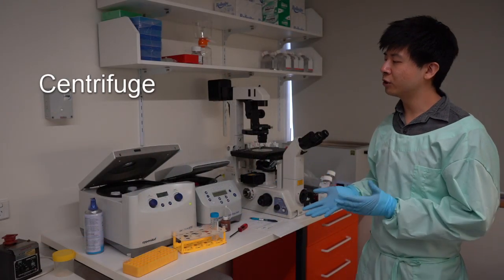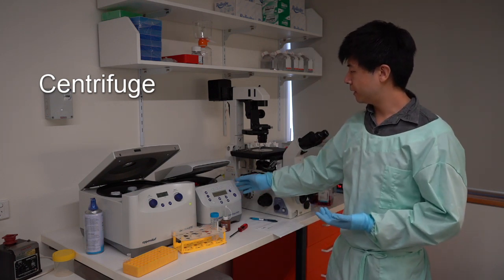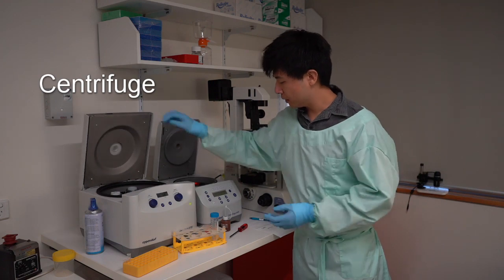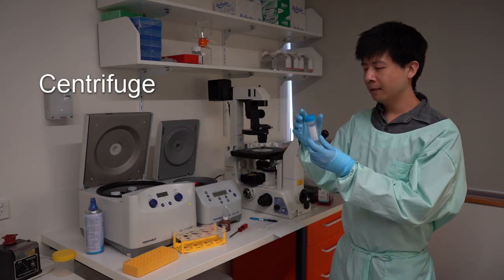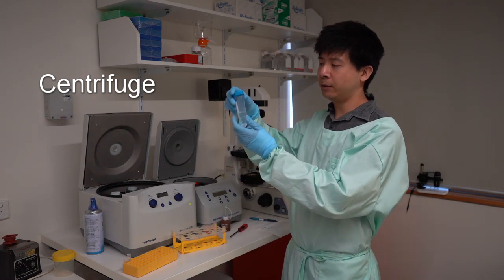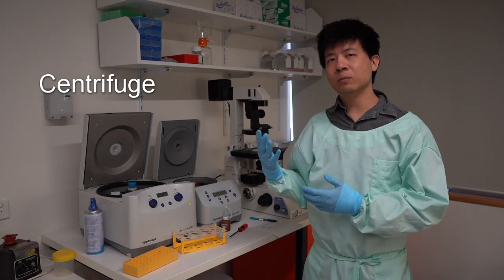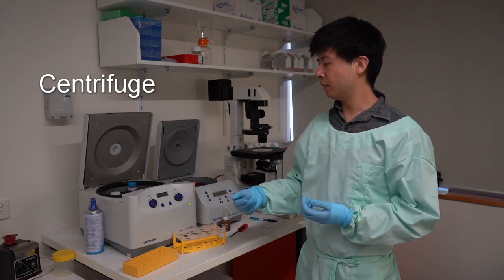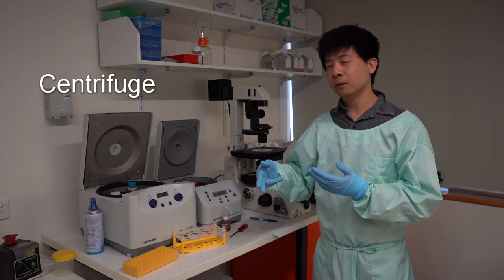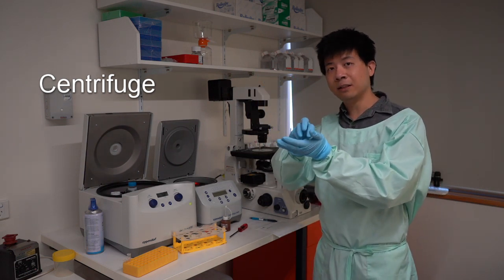These are the small instruments required for cell culture, including the centrifuge. We use the centrifuge to spin down cells. We insert the cells into centrifuge tubes and place them into the centrifuge, then start it at a low speed. This applies a g-force onto the tubes such that any large particulates, including cells, are pelleted to the bottom.